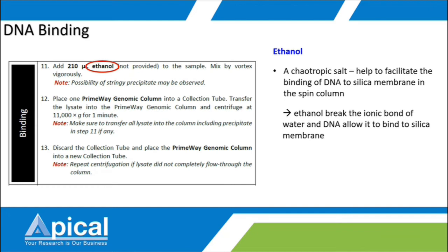So for DNA extraction or nucleic acid extraction, you should use non-denatured ethanol. Okay, so remember to ask for non-denatured ethanol when you want to do the ordering.